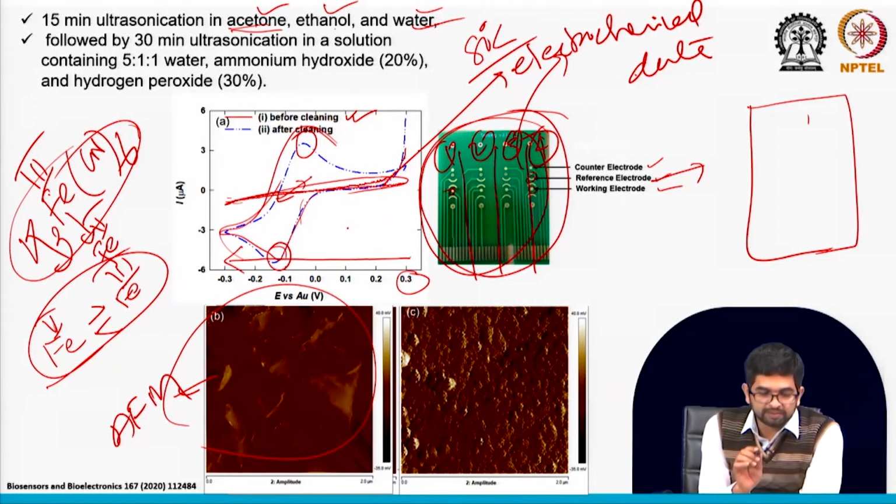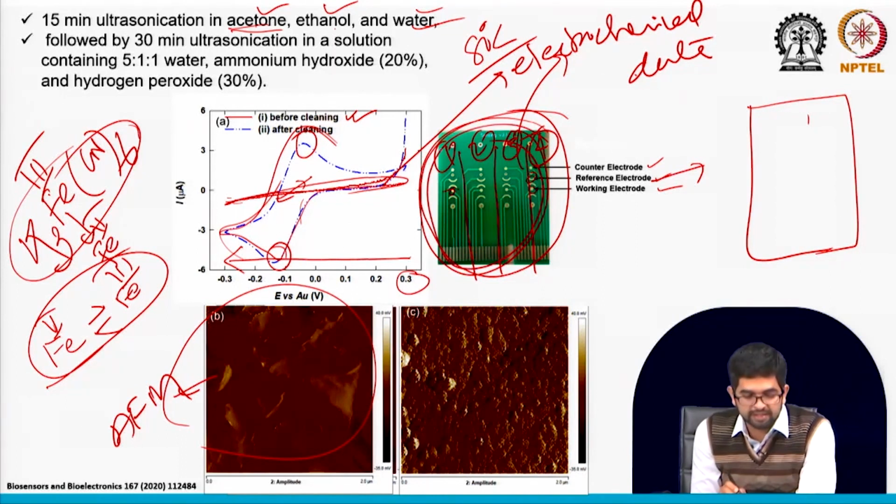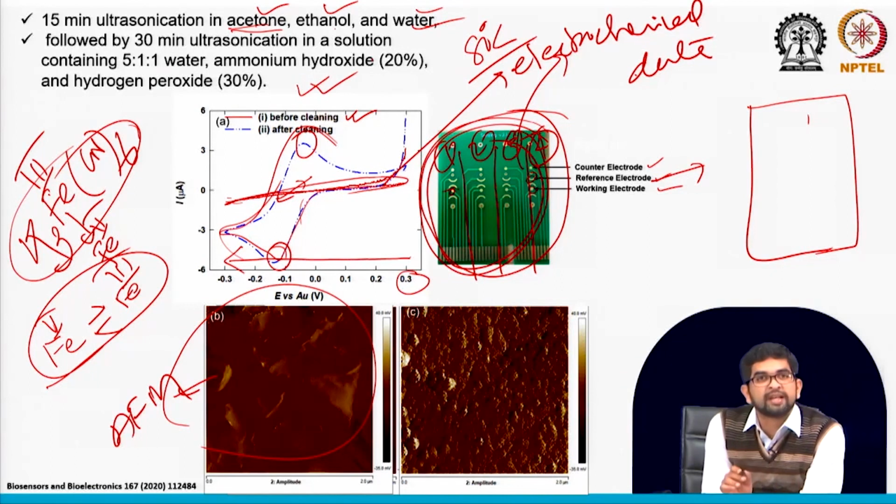So, this information is why you should do this kind of cleaning whenever you receive PCB electrodes from a PCB factory. Let us remove all the organic stuff from the surface. There is a huge amount of organic material on the surface. I will show you the XPS data now.